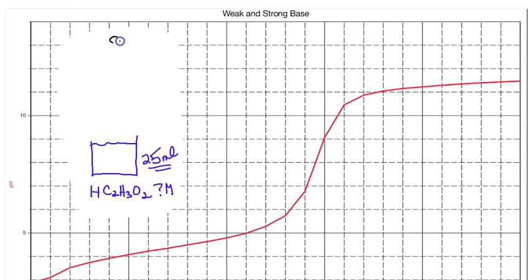In a burette, with the standard solution, the solution that we know of, we had a 0.03 molar solution of calcium hydroxide. This is the standard solution, and sometimes we would call this the titrant. It's important to understand these word problems: we're titrating this acid with this standard solution that we know of. Titration means you're using a known amount of the standard solution to get the unknown concentration.